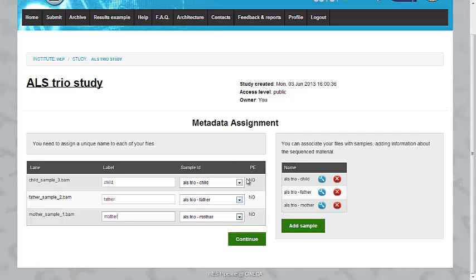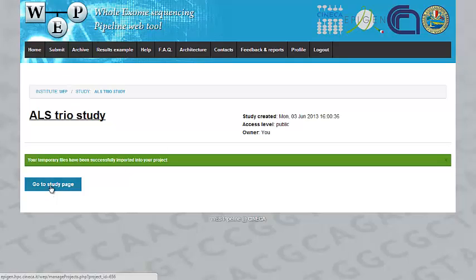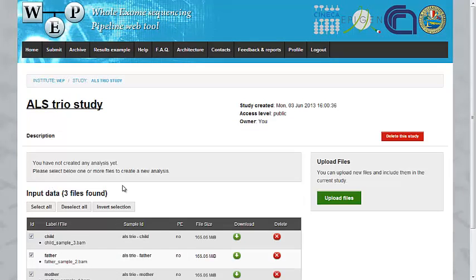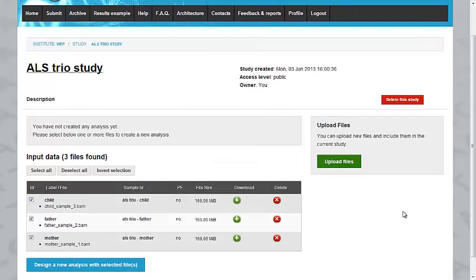When the metadata assignment is over, you just have to click the Continue button. OK. So, the upload process is complete. We return to our study page and we can see our files with all the information.